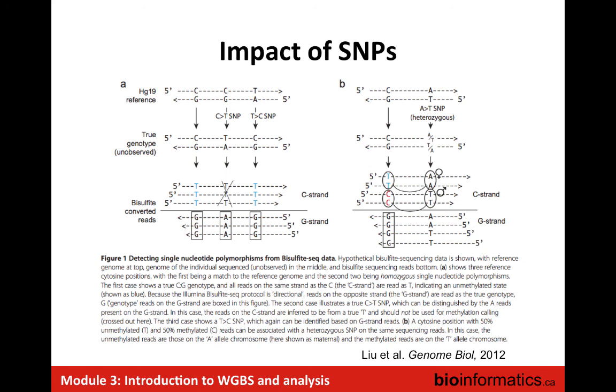I mean, think about the fact that there's also errors in the mix of this. It's not always perfect, so you also have that sometimes. So it's really challenging to do variant calling. To do variant calling combined with this is really quite challenging.